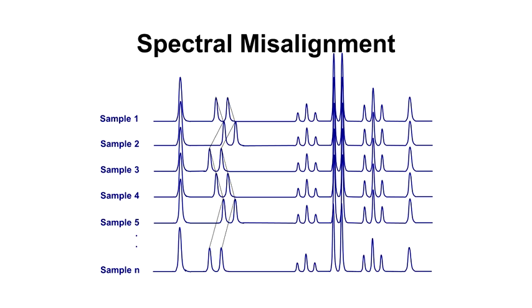This will mean that if you do statistical comparisons against these peaks or these bins or these XY values, you'll come up with very misleading answers. So what you have to do is force those peaks into alignment. This is a spectral alignment process.